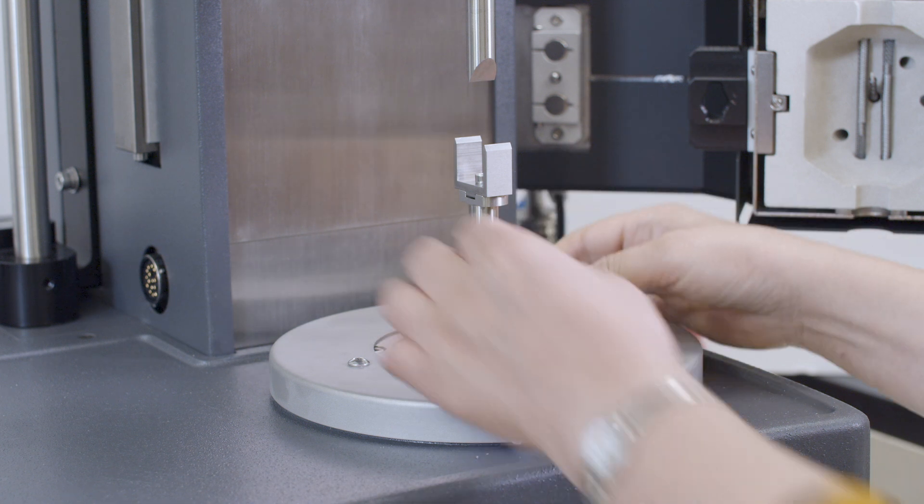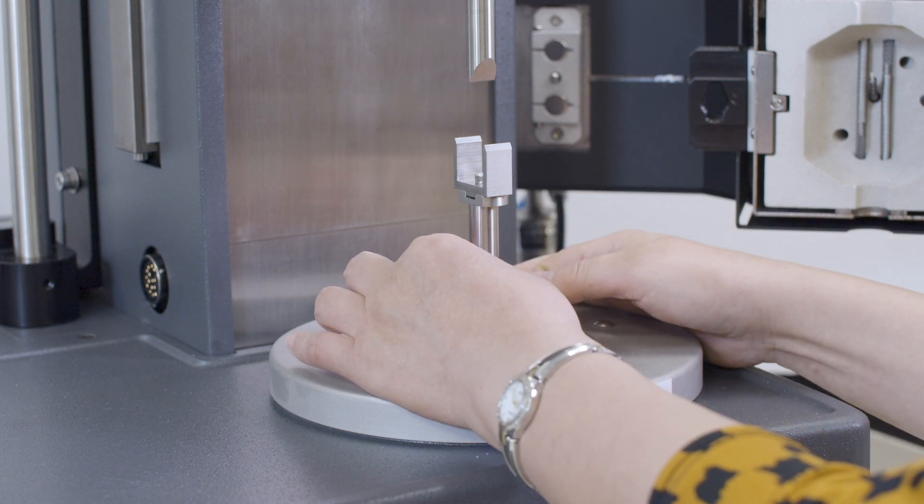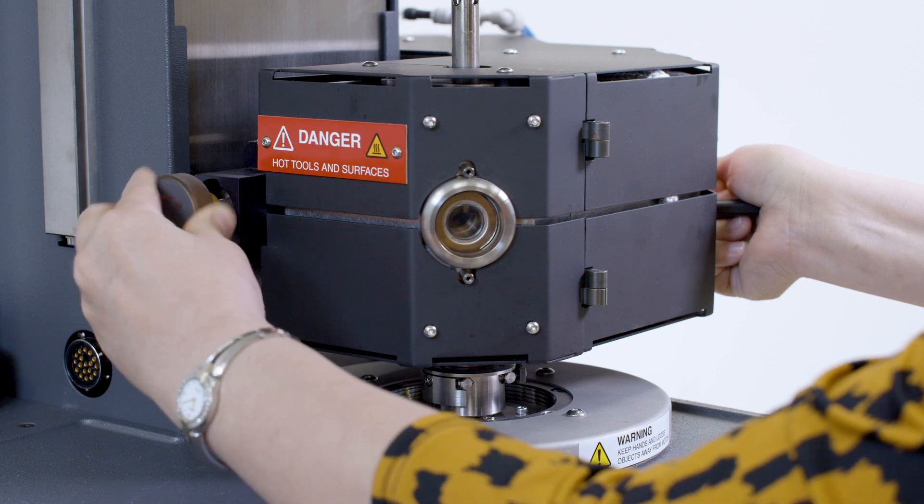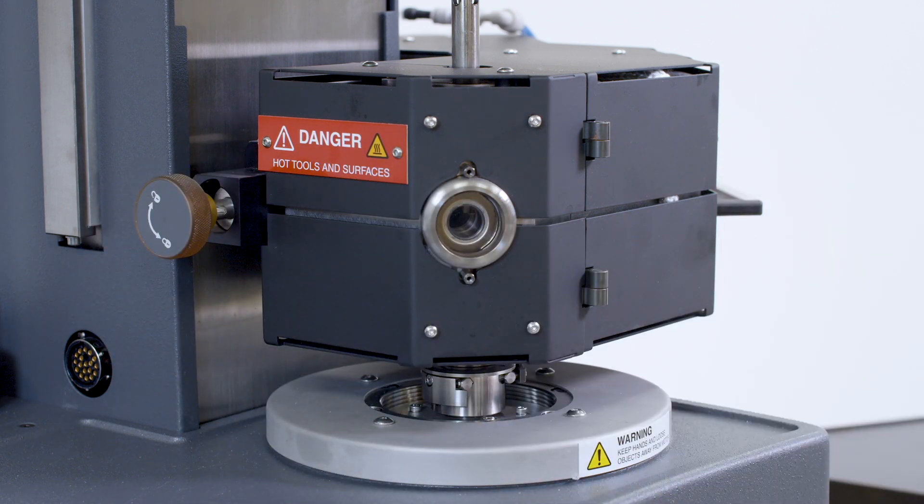When mounted on the ARES-G2, the three-point bending clamp is used in tandem with the forced convection oven for temperature control.